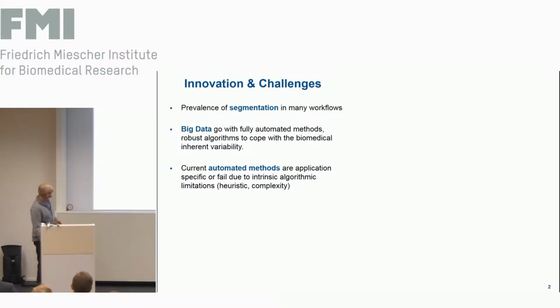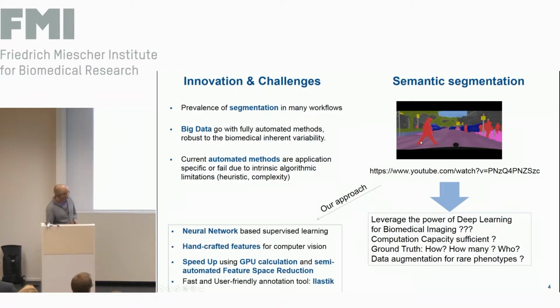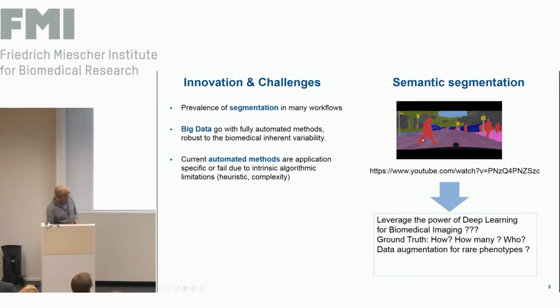So looking at image segmentation, naturally we had our look at the state of the art at the moment, which is, as you heard from Thorsten, actually deep networks that completely challenge this task.